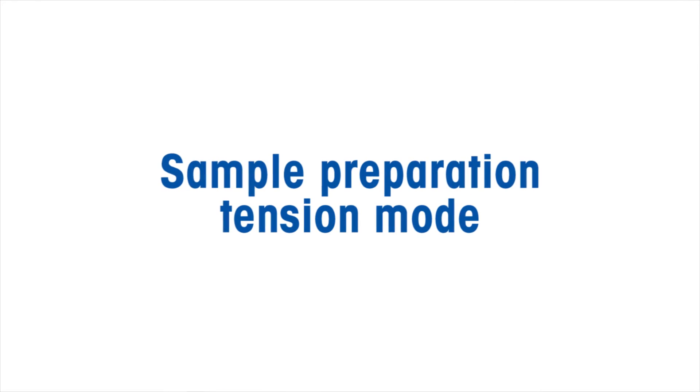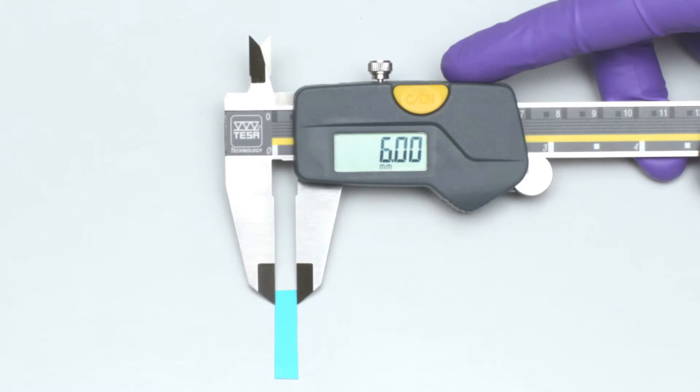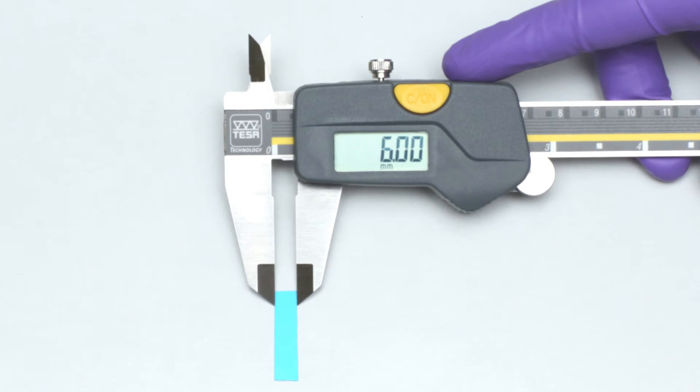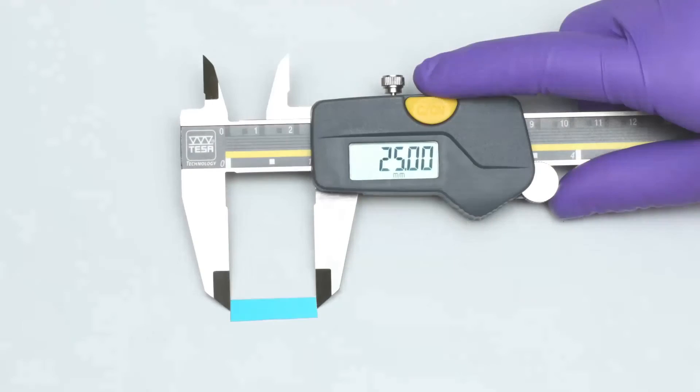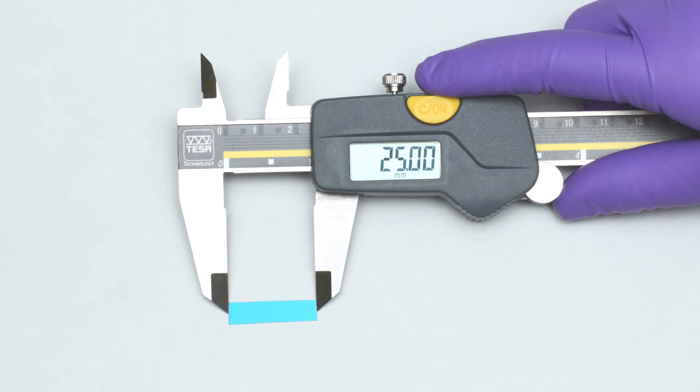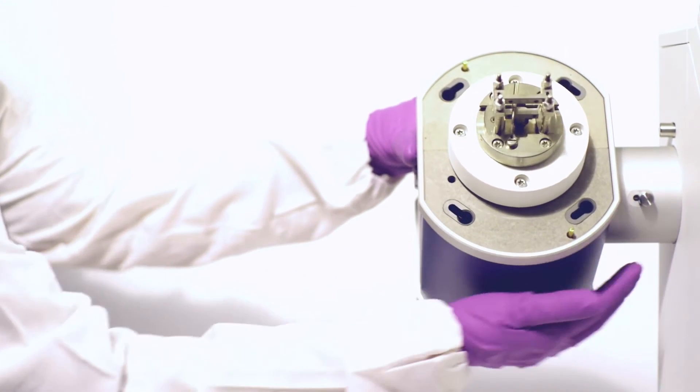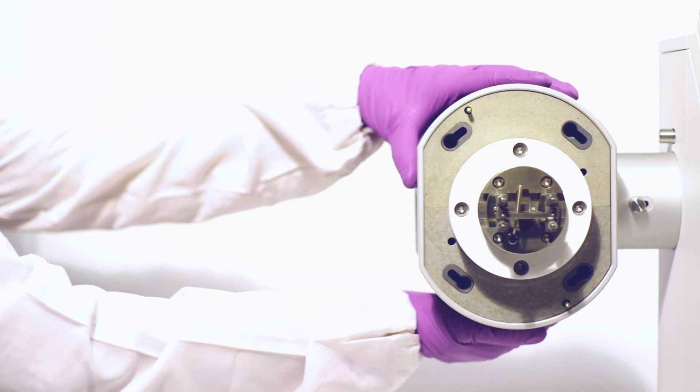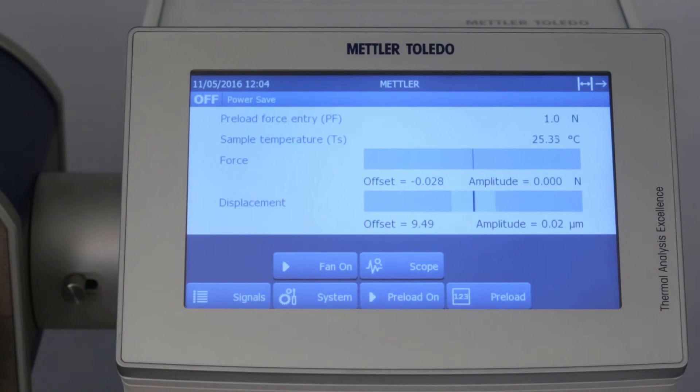Sample preparation for tension measurement: A polyethylene terephthalate sample of 6 mm width and 25 mm length is prepared for the measurement. First, we need to bring the measuring head into a horizontal position. Before we clamp the sample, it is important that we enable a preload force.